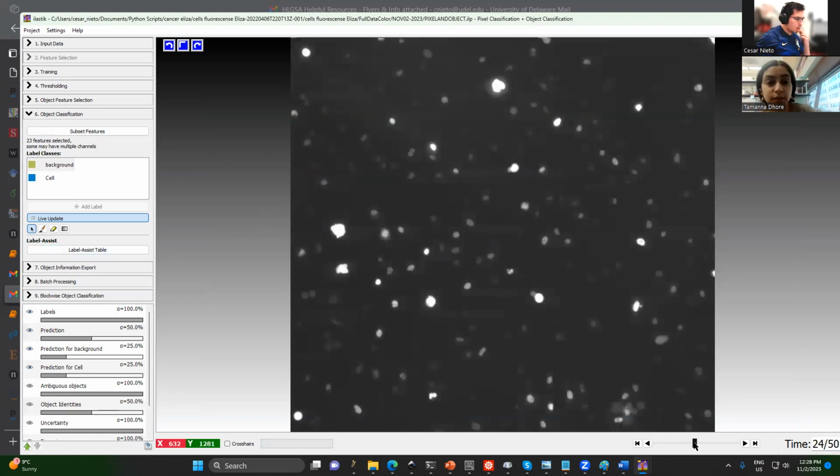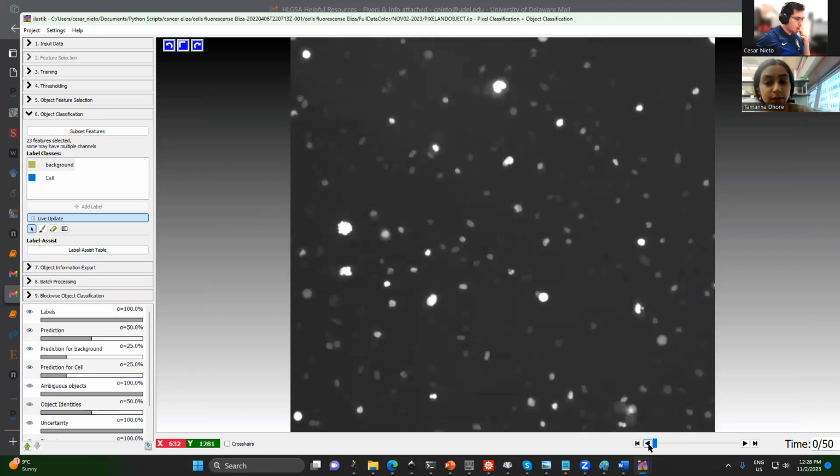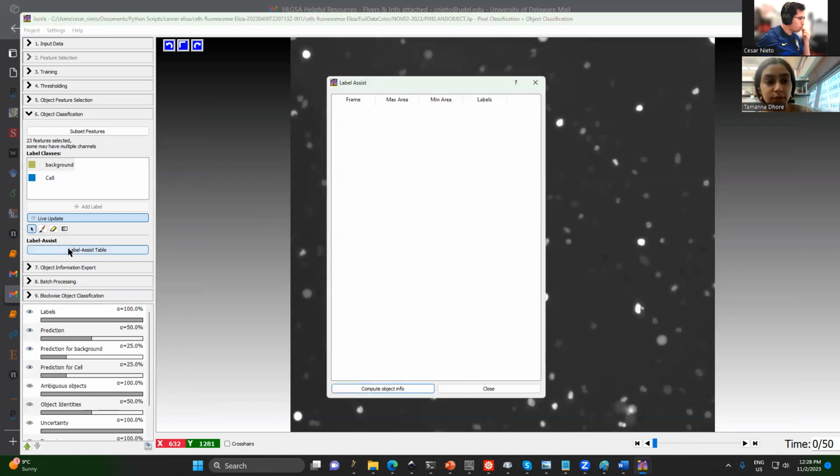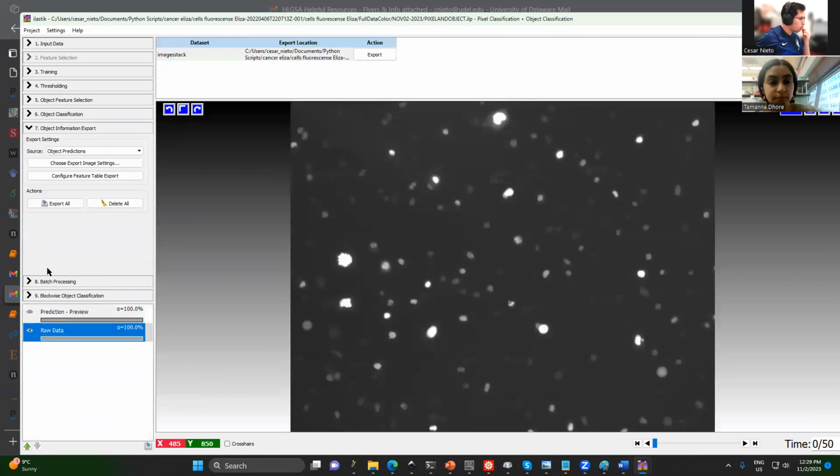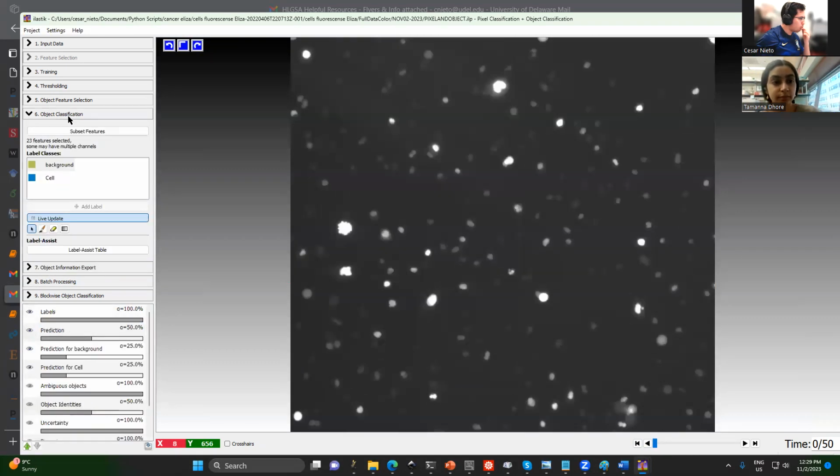Yeah, this was the same issue I was having when I was doing the tracking. It wouldn't let me paint on the image. Okay, okay, okay. This is only label, no? If I'm right.